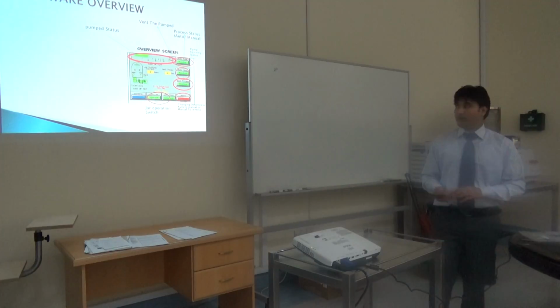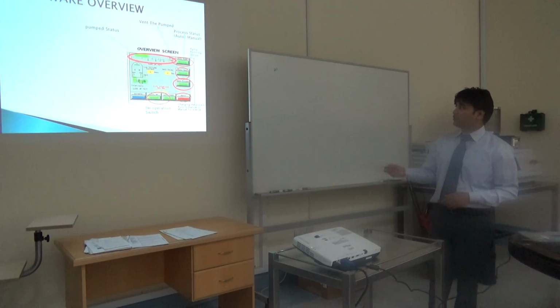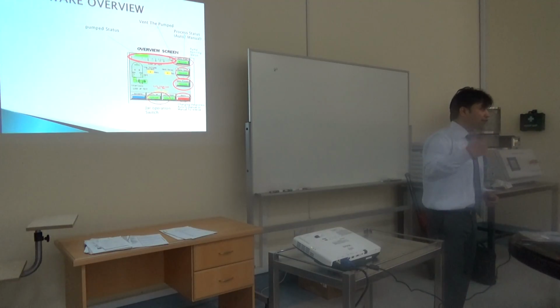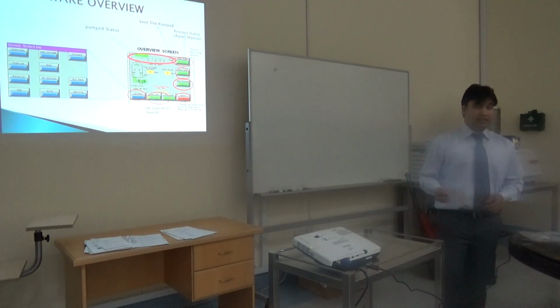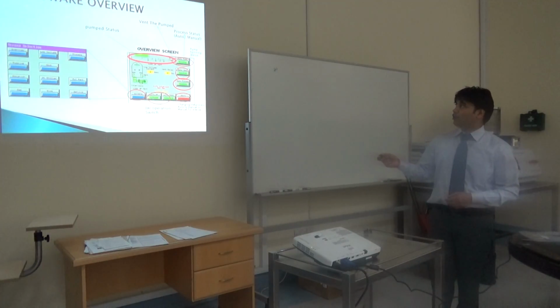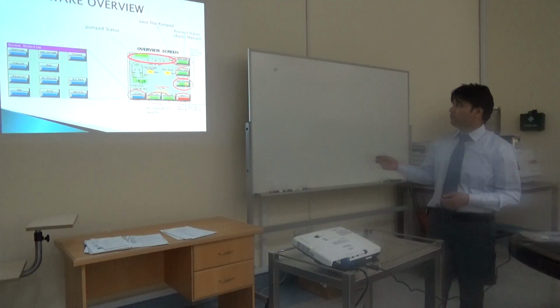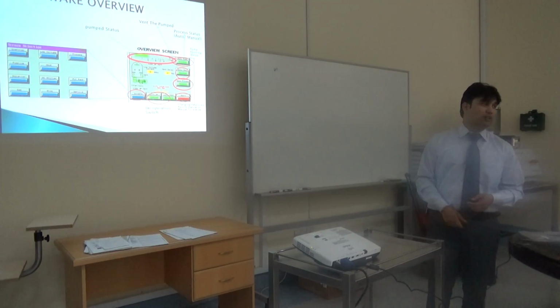And here, one more touch point. By the help of these two touch screens, we can take the bell jar either up, or we can take it down. If you touch this screen, then another display will open. This is called the overview screen. When you first turn on the system, the first display will come. But when we touch this screen, the other window will come.